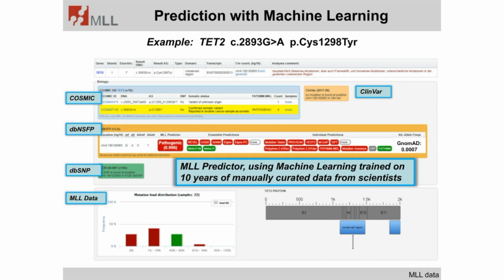As this is a very difficult task, we trained, in addition, a machine learning algorithm, which was fed with the classification data from the MLL scientists created over the last 10 years. In theory, we should receive a consensus classification recommended with the same accuracy as all our trained MLL scientists and all available databases in combination.